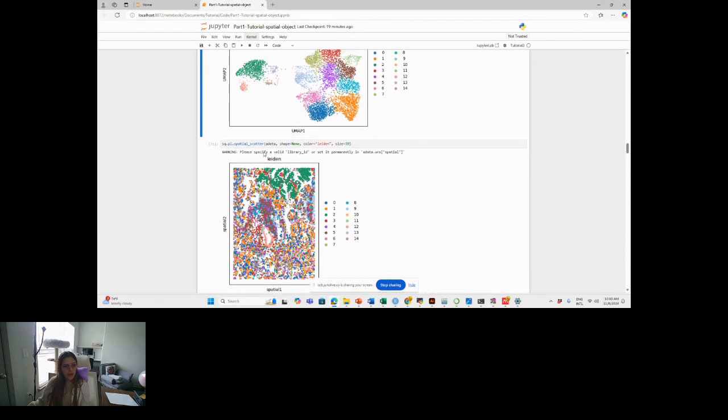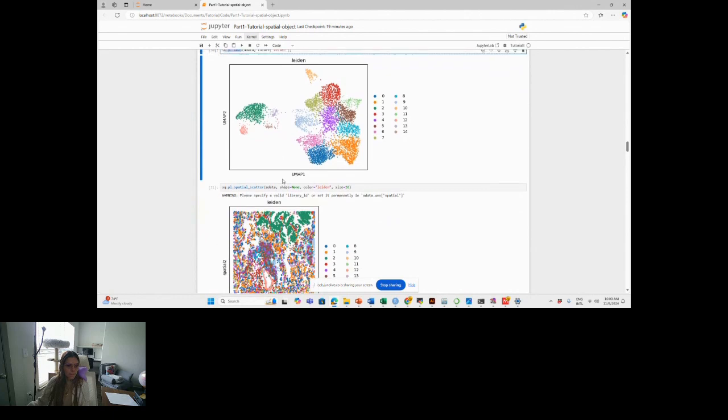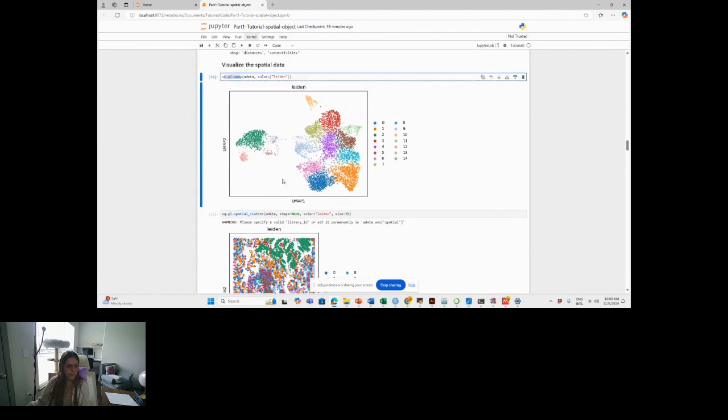So after that, clusters are shown. They are generated using the gene expression, right? Yes, they are generated using the gene expression, and what we assume is that cells with a similar expression are going to be grouped together in the different clusters. So here we see about 14 clusters, or 15 clusters.